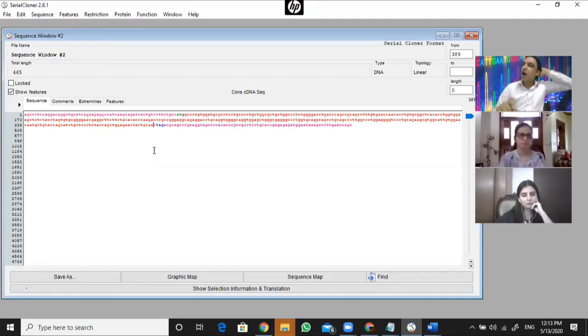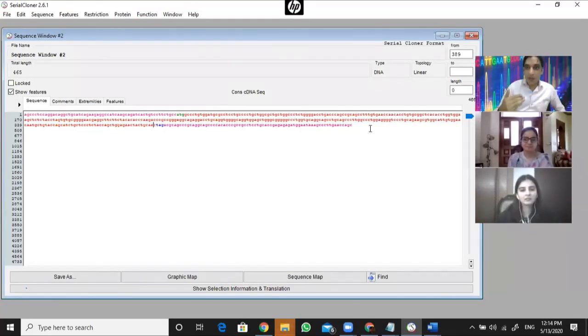You need a software which understands the difference between the alphabets and DNA. How that software can help us to understand about the sequence we know. Remember, we placed a very small sequence. You can place like 5,000 base pair, 10,000 base pair sequence. You can do whatever. There is no limit in using that software.